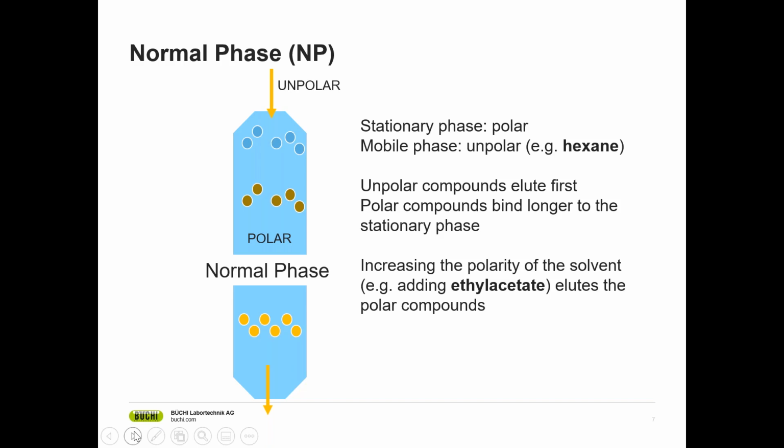Chromatographic separations with the normal phase, which is more polar than the solvents, are considered as normal adsorption chromatography. Silica with various porosities and particle sizes is the most widely used adsorbent for this purpose and should be the first choice for test runs. In some cases, aluminum oxide or for special purposes also polyamides are used. They are also considered more as normal phase stationary phases.